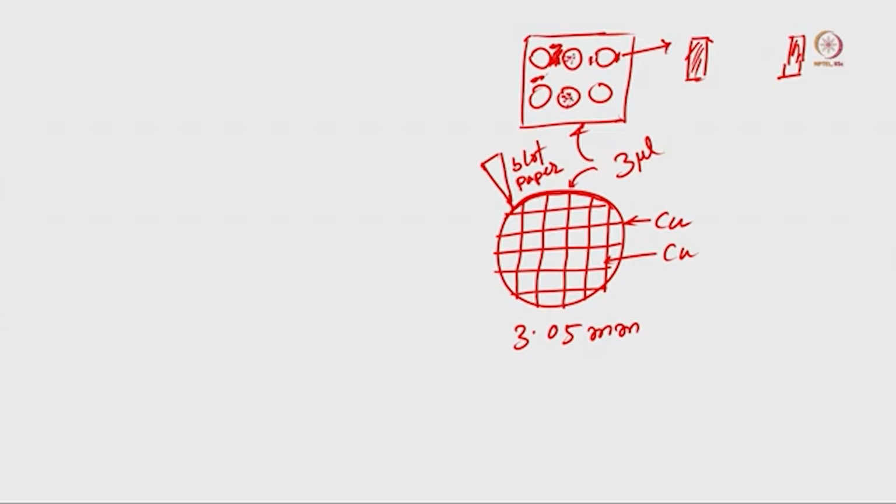Solution means it is basically carbon, hydrogen, nitrogen, oxygen, and it is a buffer solution where we have phosphate buffer, tris buffer, and then the pH will be adjusted. And why I said carbon, hydrogen, nitrogen, oxygen: that is our biological science sample.